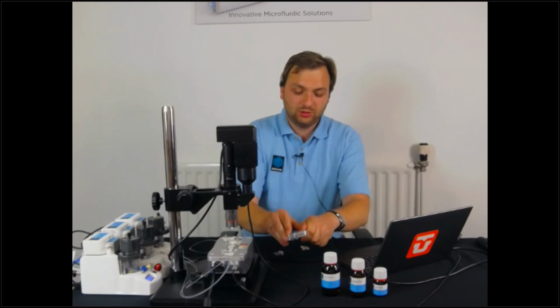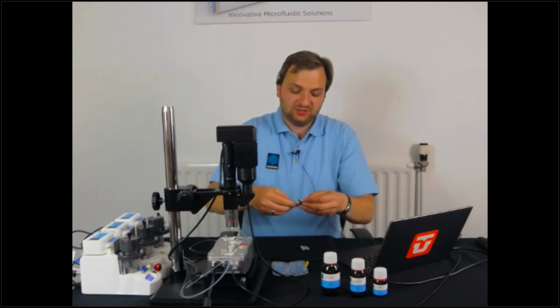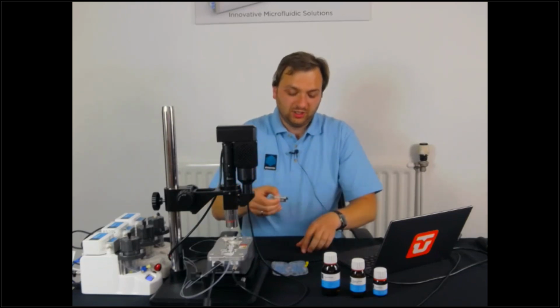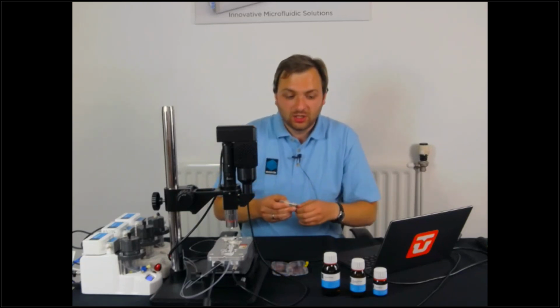And then a chip would mount in easily and securely. And this interface is good for up to 20 bar, and so can generate substantial throughputs.